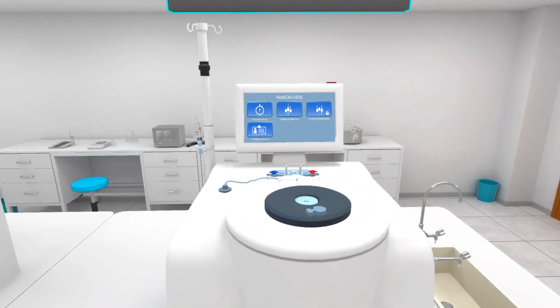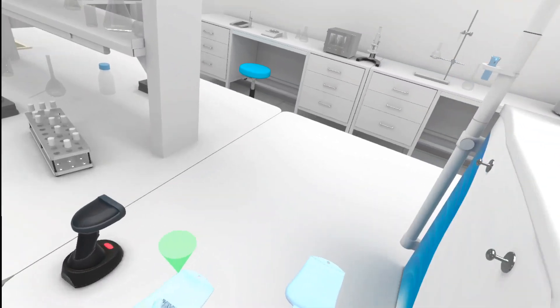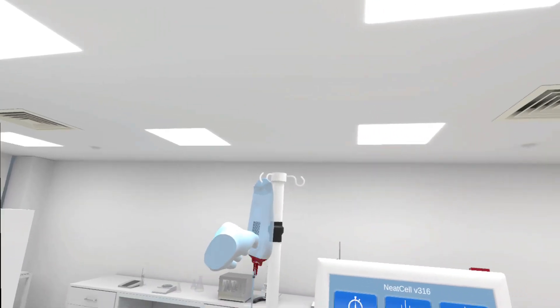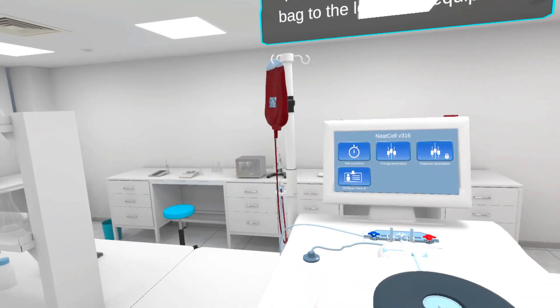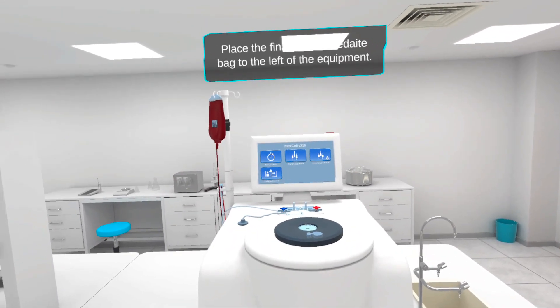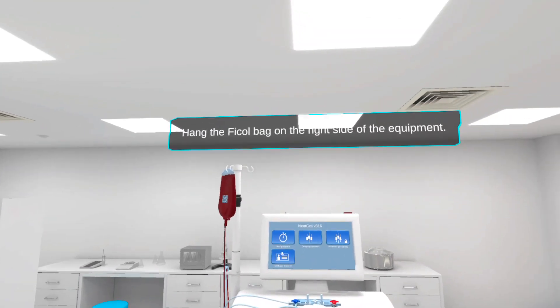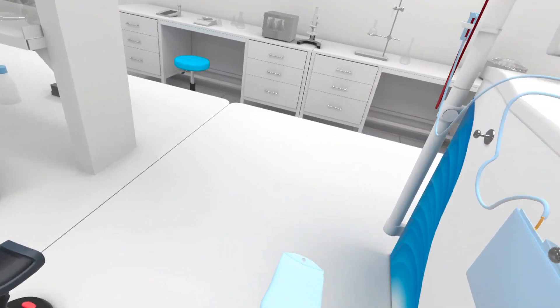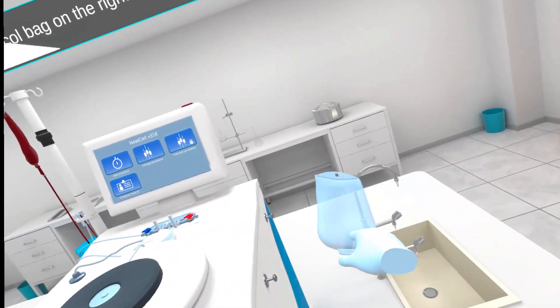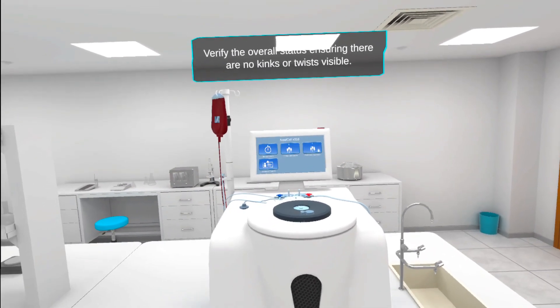Pick up the drip chamber and hang it on the tall hook on the left. Place the final or intermediate bag to the left of the equipment. Hang the Ficoll bag on the right side of the equipment.